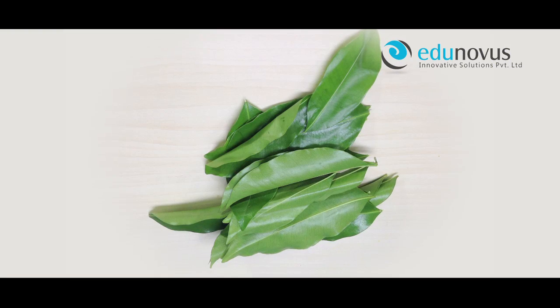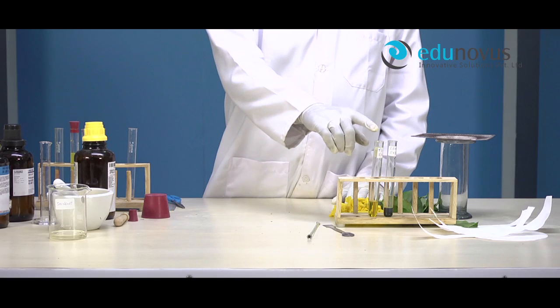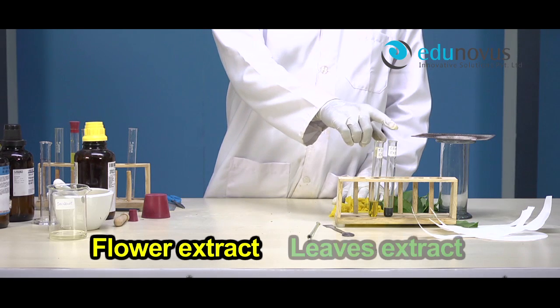In a similar way, you need to extract juice from leaves. Here we have flower extract and leaves extract ready.